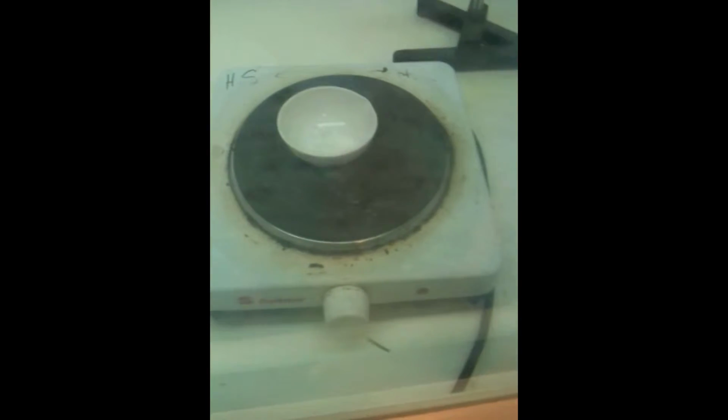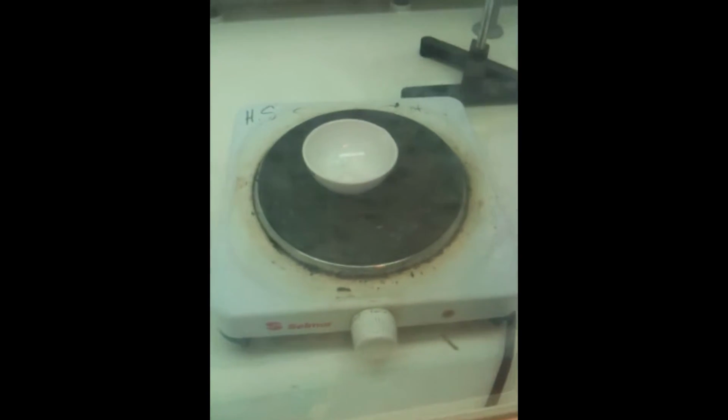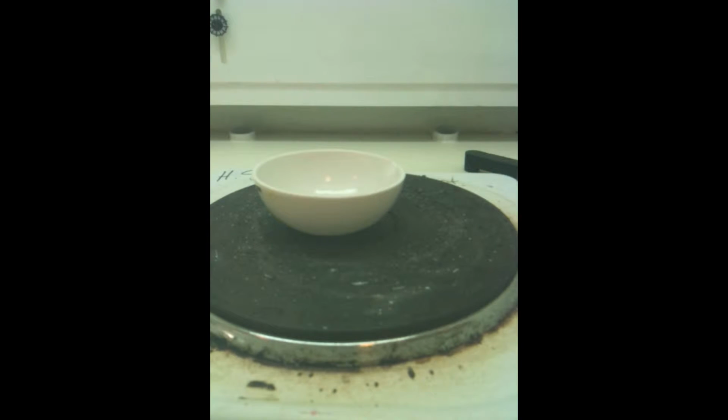Now we're going to look at melting this. When it melts, we stop it. Just gonna stand there and watch me burn. Well, that's alright.